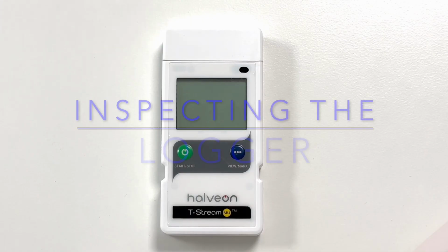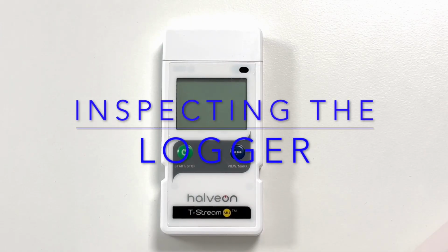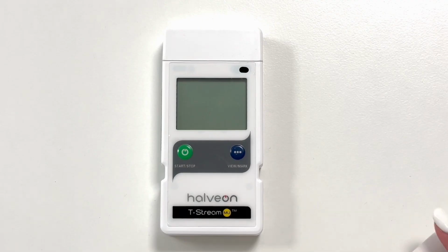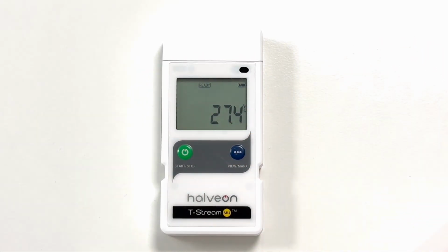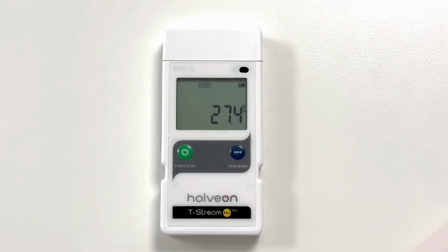Part 1. Inspecting the logger. To check if the device is ready, single press any button to activate the screen. If the display says Ready, it means the logger has been activated and is ready to start recording. We can also see the battery status. In this case, it has full power.